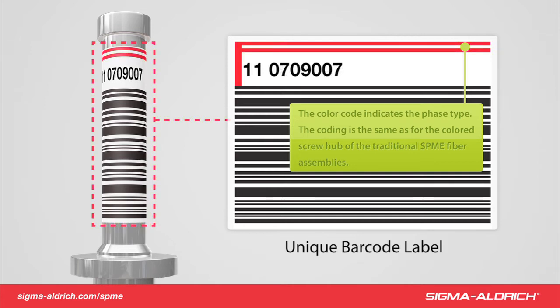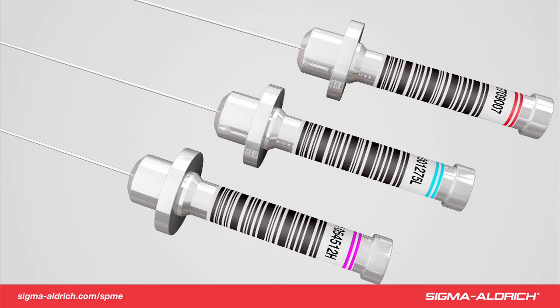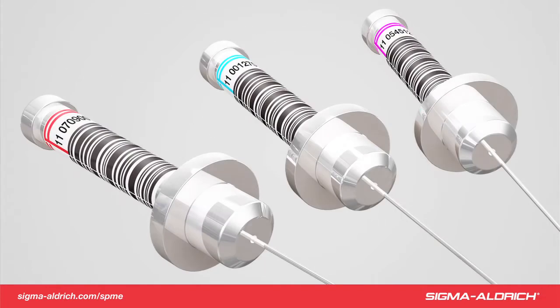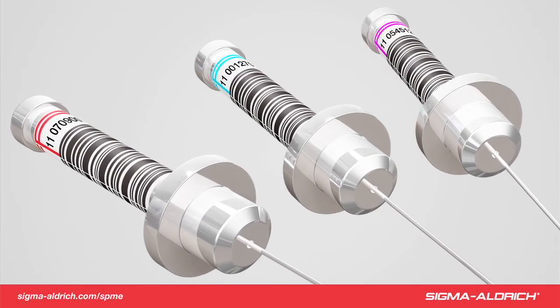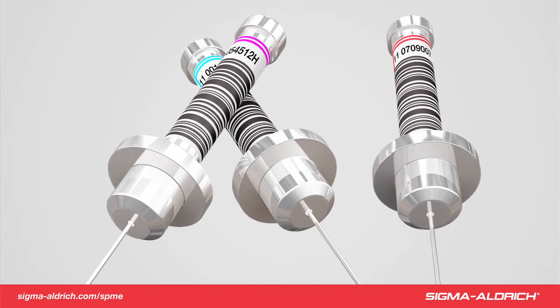The color-coded top is the same as the common SPME assemblies. For example, the red fiber is a 100 micron PDMS fiber assembly. One stripe on the label identifies a 24 gauge assembly, while two stripes identify a 23 gauge version. The SPME Fast Fit assemblies are available in all common SPME fiber phase coatings, so current applications can be directly transferred to existing methodologies. The color coating is associated with the different fiber phase chemistries.